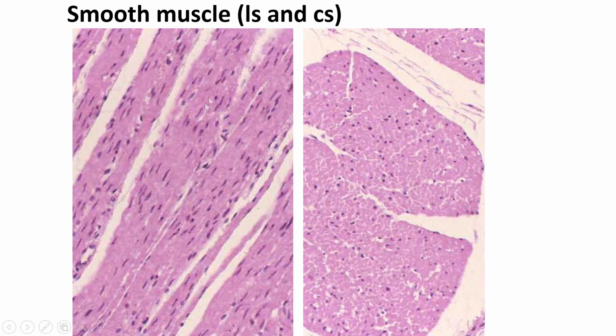And then smooth muscle, this is nice. And if you look, you see a little bit of a wavy appearance in the nucleus right here. It looks almost like an inchworm. That tells us that this muscle is contracted, okay? But notice how dense the nuclei are. So this is very cellular. Notice the cross section. We have pretty much round profiles. They're going to be of different sizes. They may or may not contain part of the nucleus.